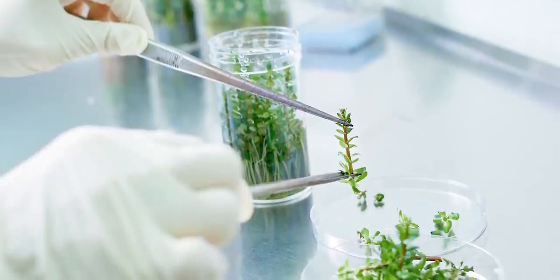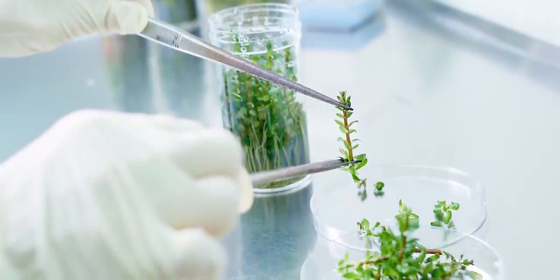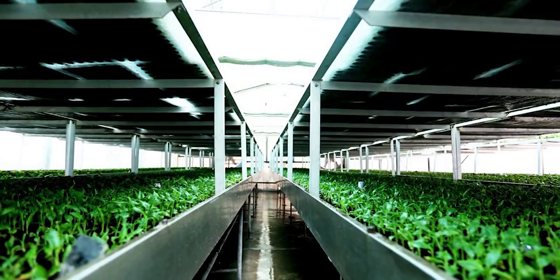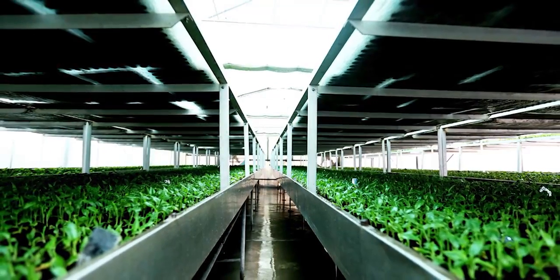What is tissue culture? Tissue culture, also known as micropropagation, is the process whereby we take a plant and we produce clones of it on a mass scale. So we're talking thousands of clones, not just a little bit of chop and prop. This process is known as a protocol.